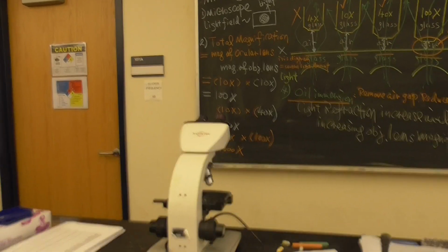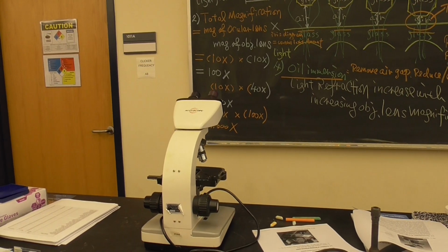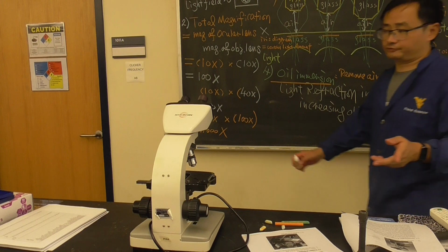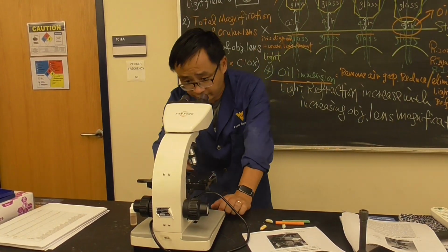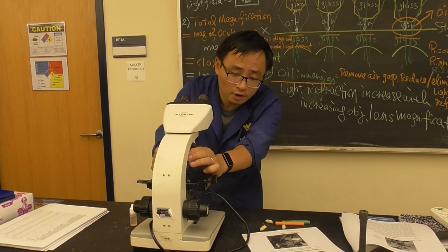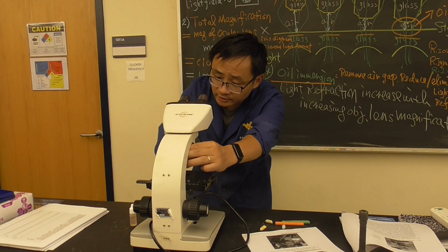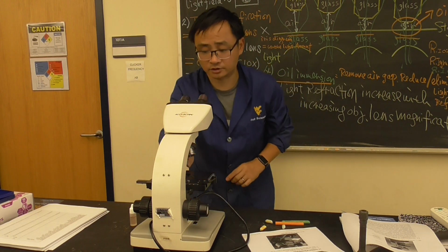I'm moving the camera a little bit closer, so I certainly need the oil right here. When you finish everything right here, remember we have 4x, this is 100x, this is 10x and 40x. We don't use these two in the first couple of labs. We're only going to do the 10x and the very long one, which is 100x.